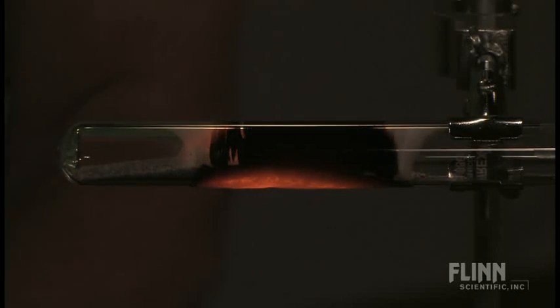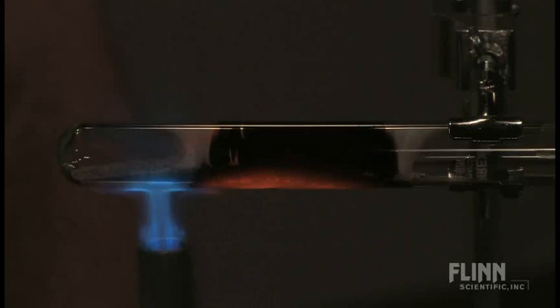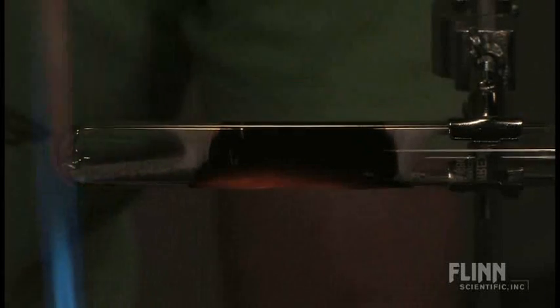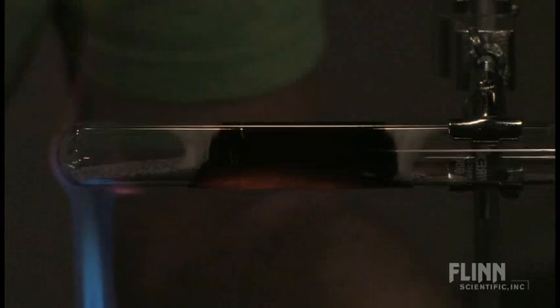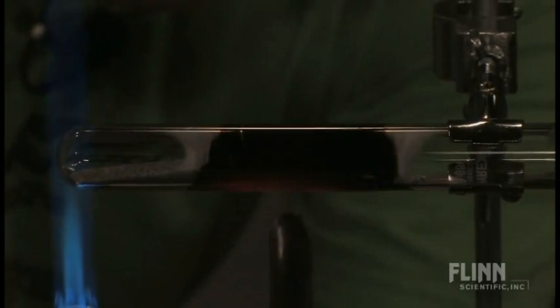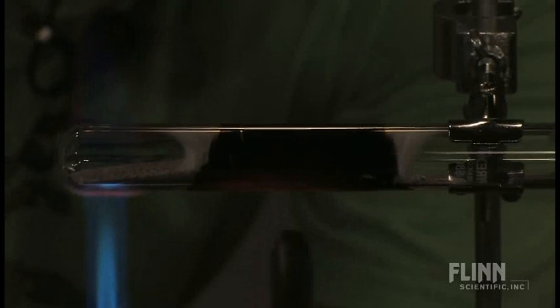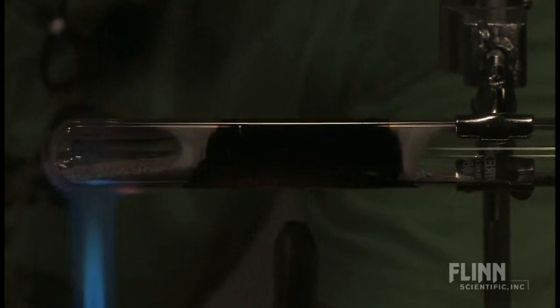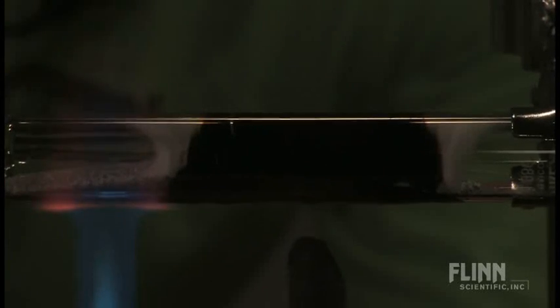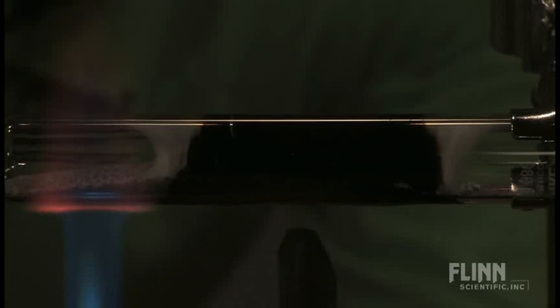Now remember something here. This is a heavy-walled Pyrex test tube. And I don't know if the camera can get here, and I'm not sticking my finger under this part, but if you look right down here along the bottom, that smooth glass that was there, it's now glowing red hot. This reaction has a delta H, a heat of reaction that's larger than the heat of reaction for magnesium burning in the air, in oxygen. There's more energy given off there. And so the test tube has changed.